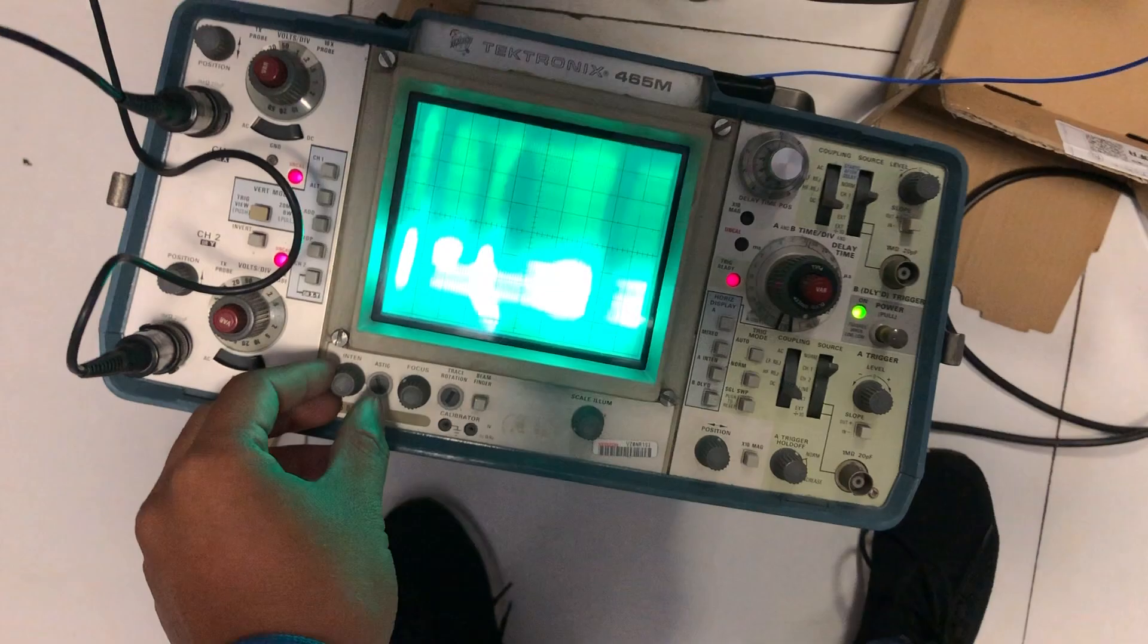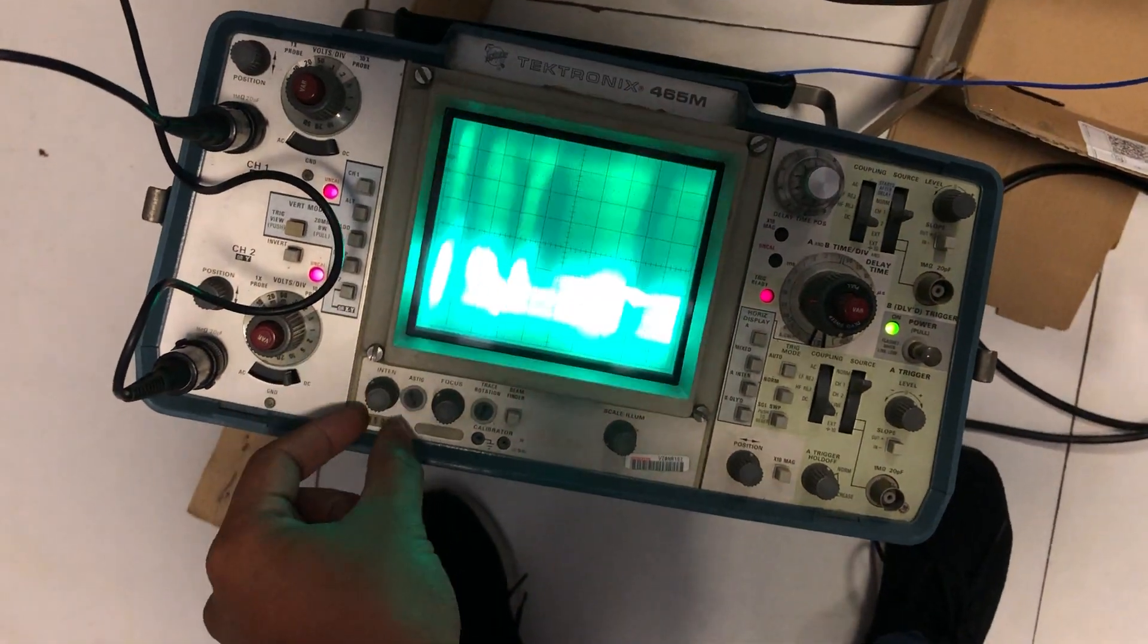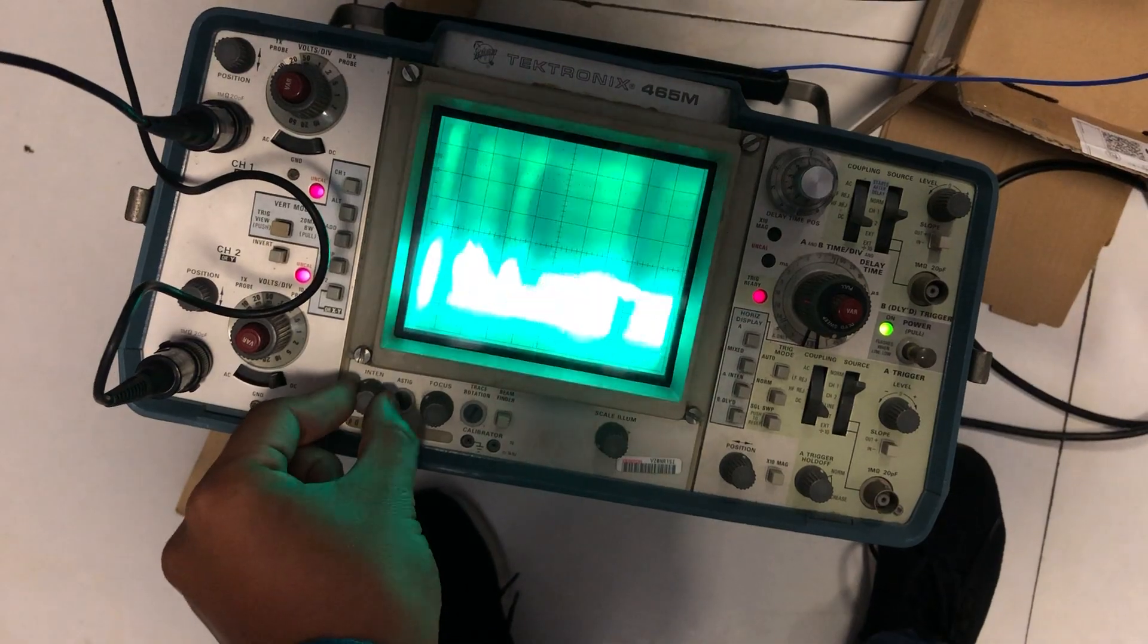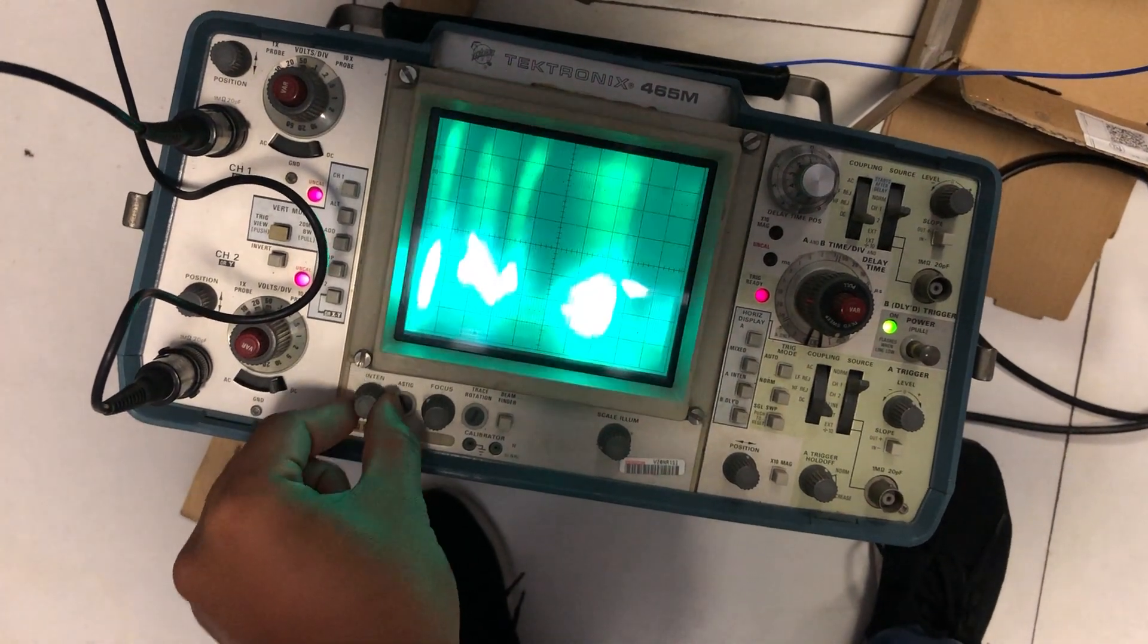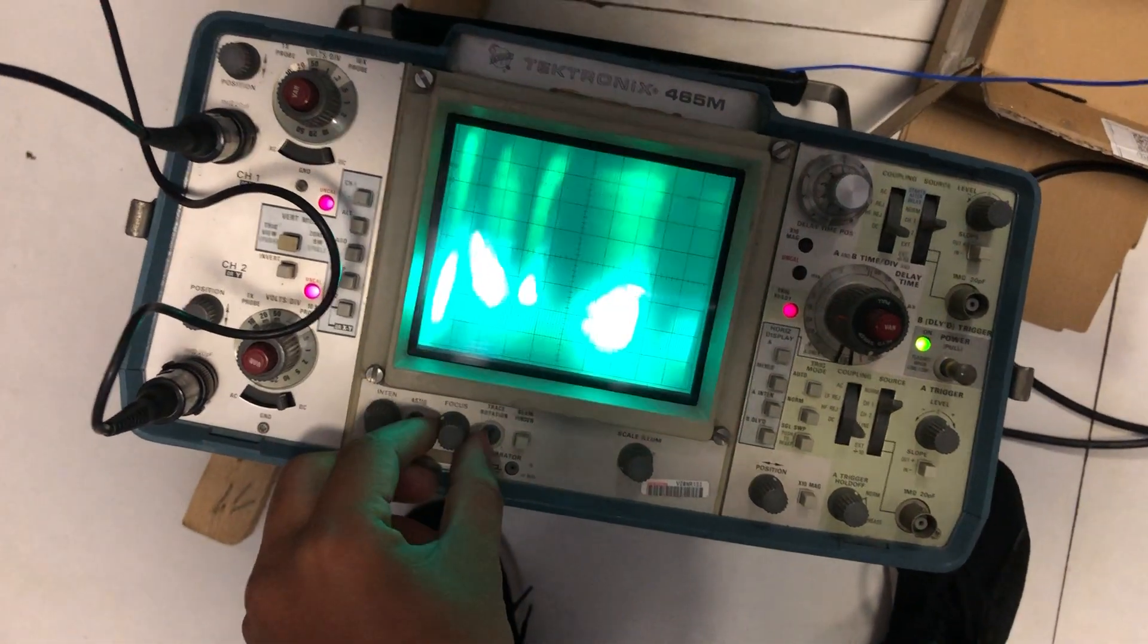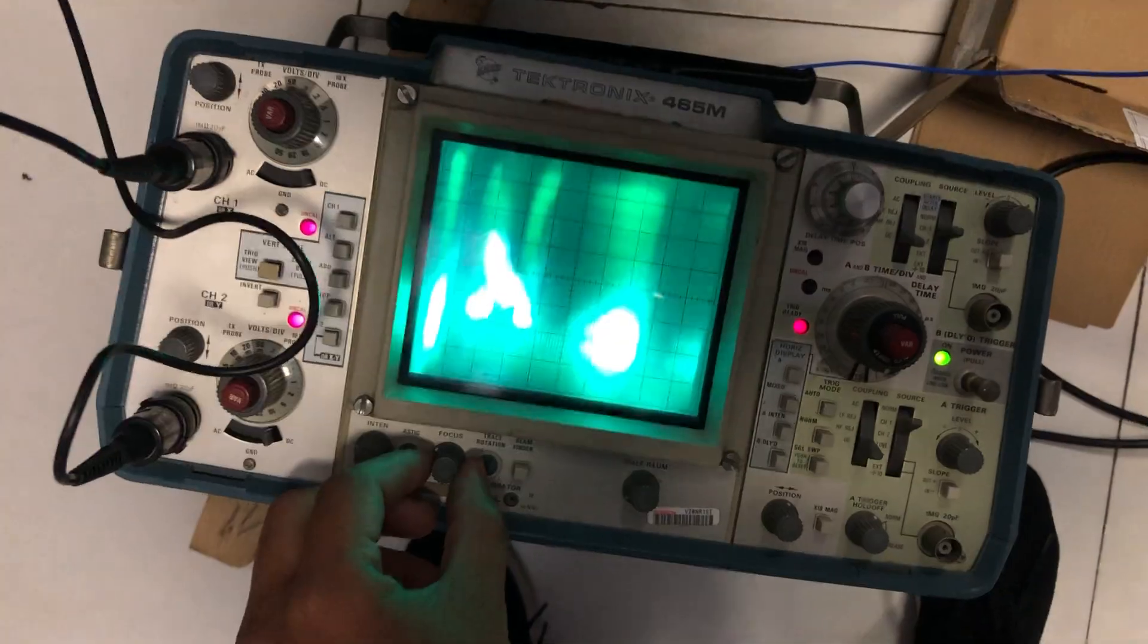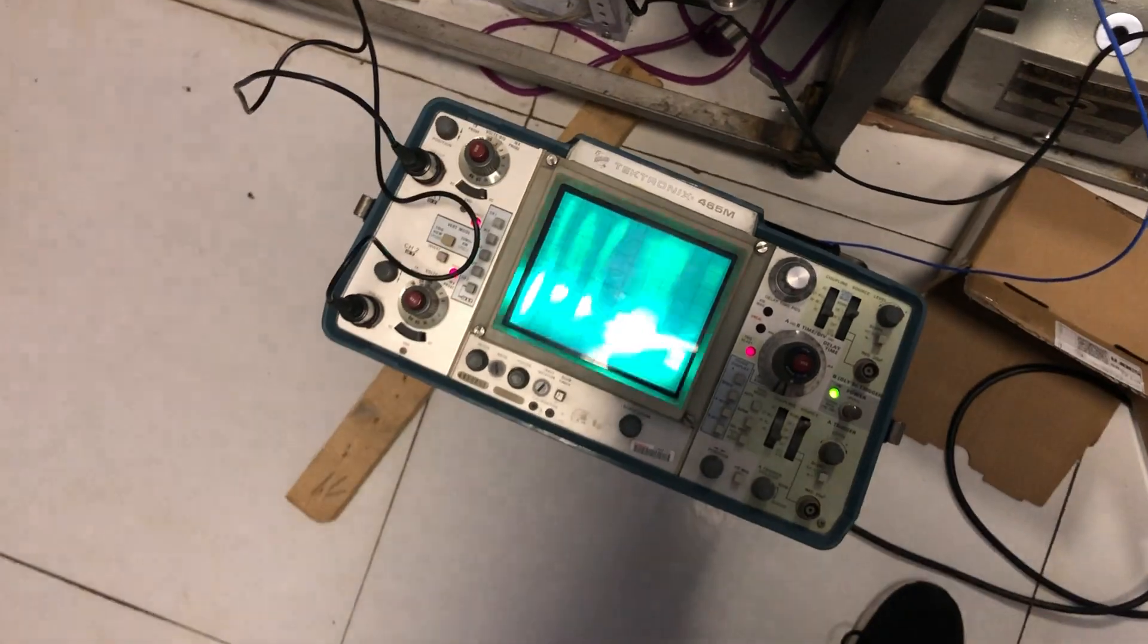So here is the control of the surface. Nothing, physically nothing. So here I'm controlling the focus. Okay, it is the best the surface can get.